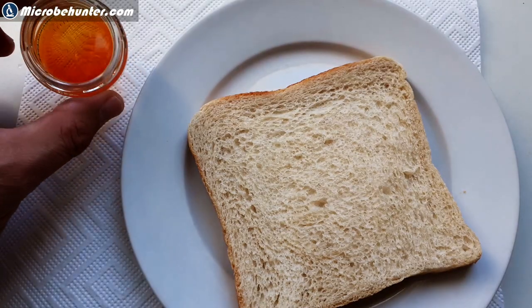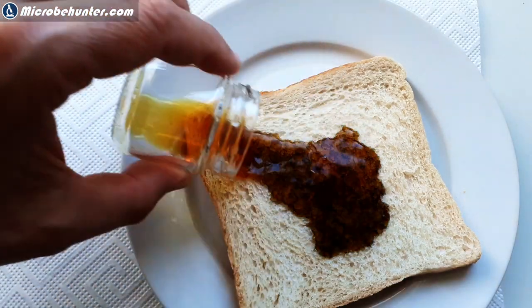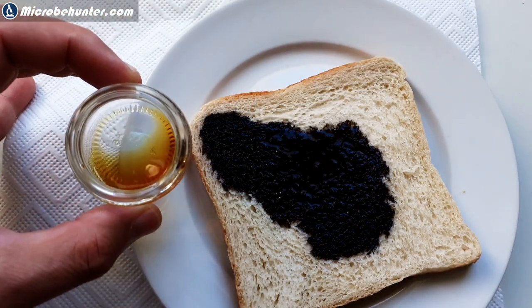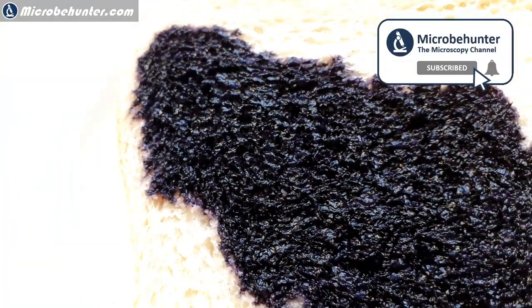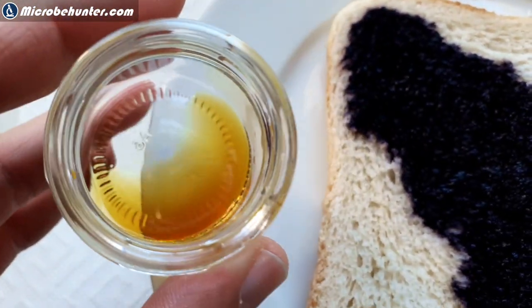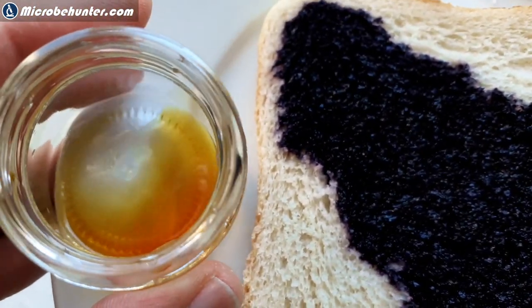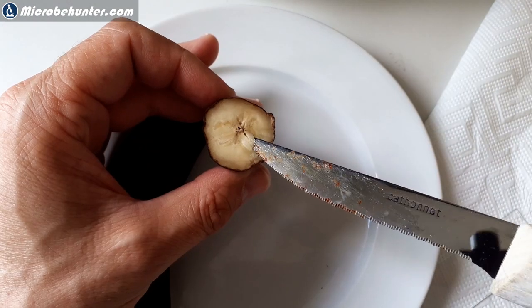I'm going to show you an iodine test. Here is some diluted iodine solution. Toast bread contains a lot of starch, and you can see a significant change in color when the starch gets in contact with iodine — it's a black-blue color. It's a very well-known reaction, and we'll be using this also to look at starch grains under the microscope.